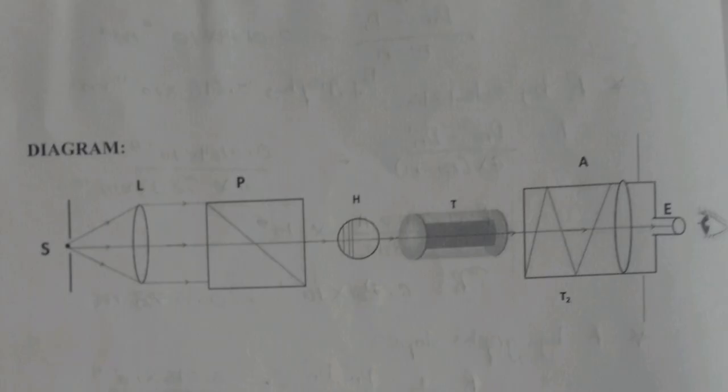What is an optically active substance? The substances which have chiral molecules in them, that is, molecules that are not symmetrical or cannot be rotated around an axis of symmetry. Such molecules are chiral molecules. When optically active substances have light pass through them, they rotate the plane of polarization of the light either clockwise or anti-clockwise.